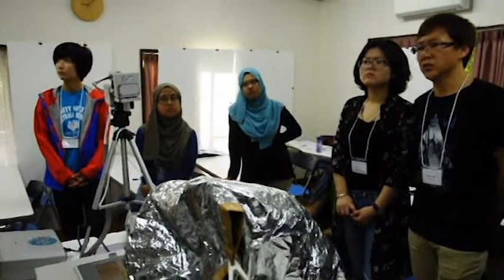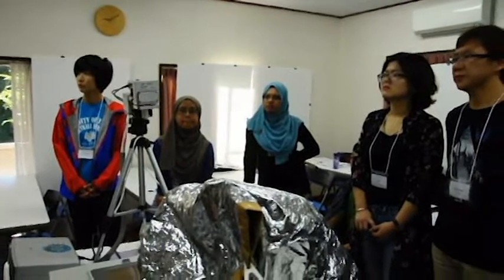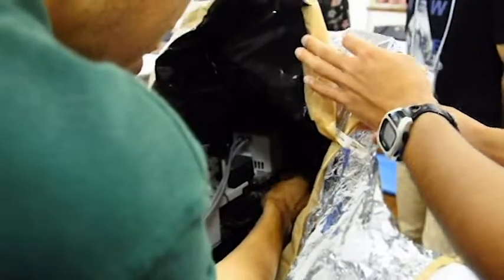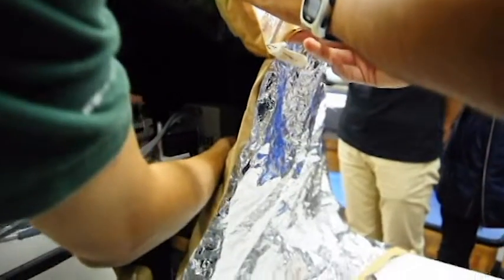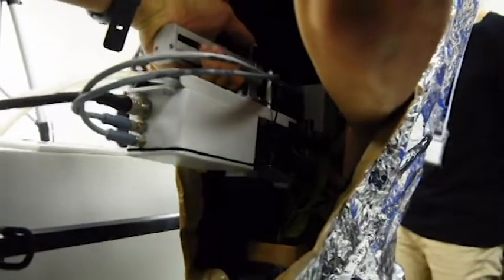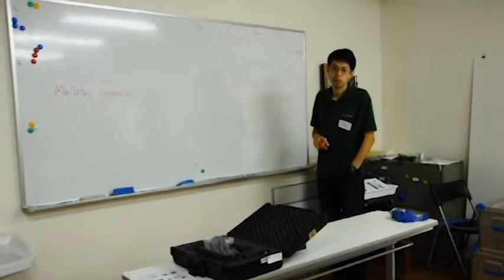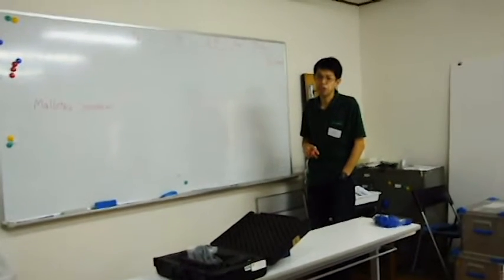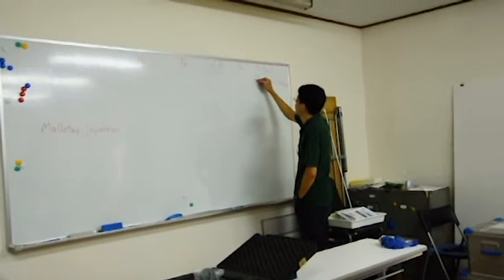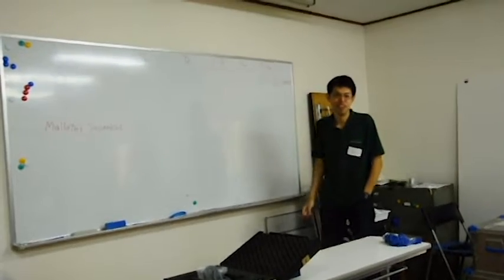Maybe the wavelength of the light is from 400 nanometers to 700 nanometers. Yeah, but the green light is. Sorry. Okay. After measurement, I will show you how to measure in the illuminated bright condition. Fv/Fm is 0.821. Okay.